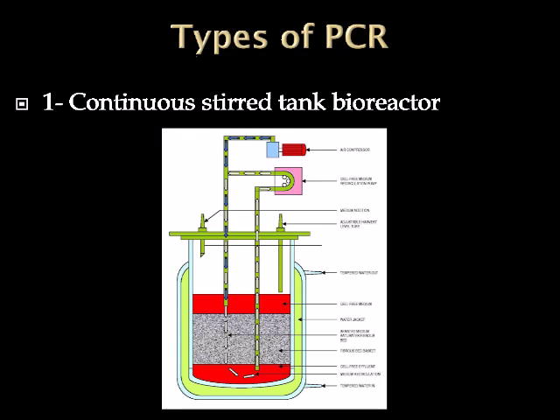Continuous stirred tank bioreactor. The content of the vessel no longer depends on time; this applies to the hold-up of microorganisms and the concentration of compounds of the medium in the fermenter. Advantages: continuous operation, good temperature control, simplicity of construction, low operation cost, easy to clean.